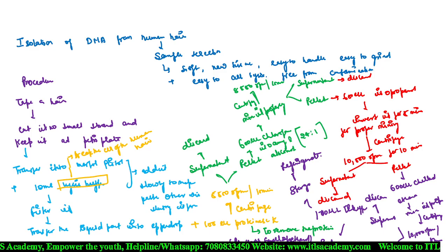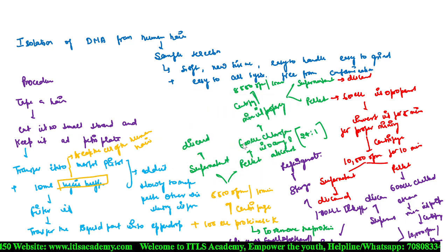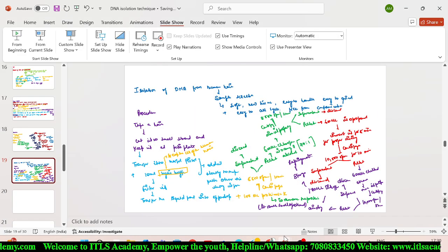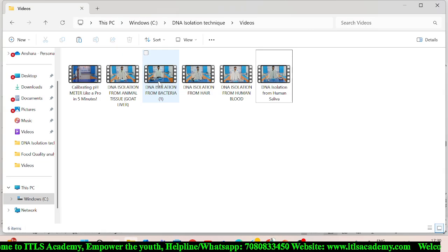Isolation of the DNA from human hair is clear? Shall I show the video? Yes, ma'am. Okay, first I will show isolation of the DNA from bacterial cell, then after that isolation of the DNA from human hair. If voice is not clear, then let me know, okay?